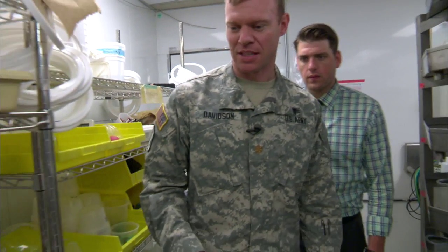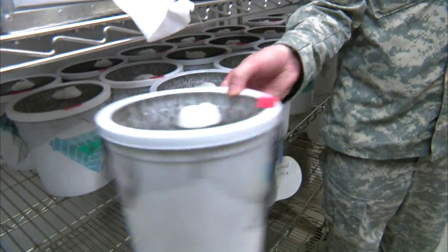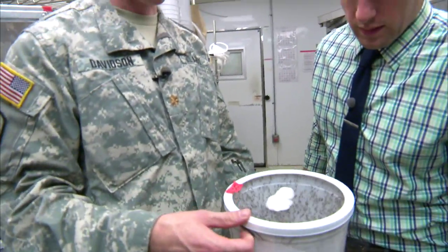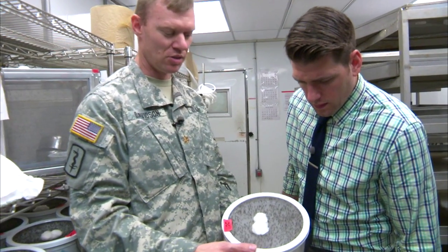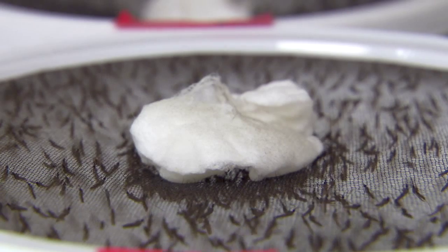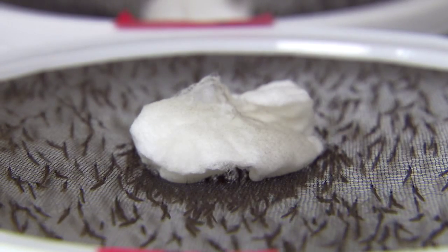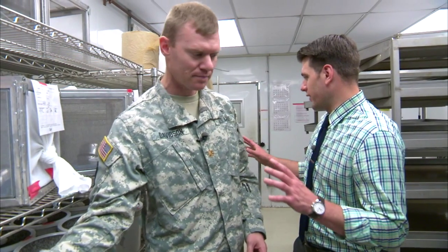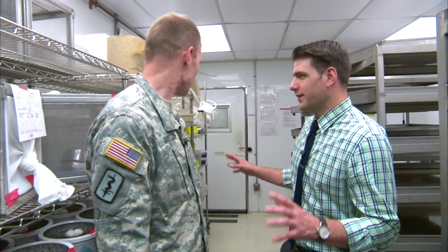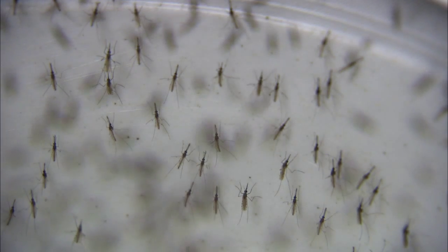As we take the pupae out, we put them in these plastic cartons. Just yesterday you can see the adults are already emerging — there's probably three to four hundred adults in each of these cartons, males and females. The cotton balls at the top have sugar water added to them, so that's what they both feed on for energy. At any given time, we produce anywhere from 10,000 to 20,000 females a week.